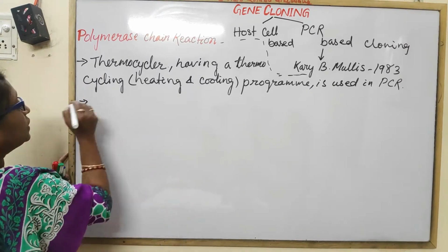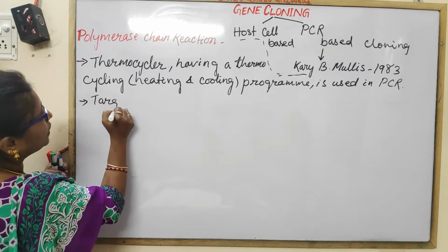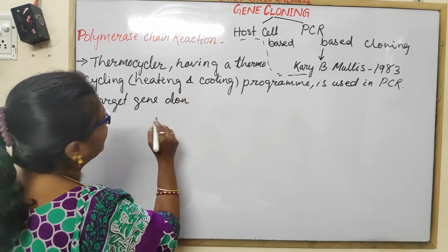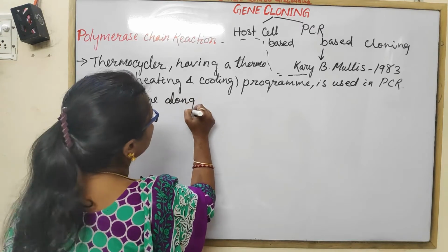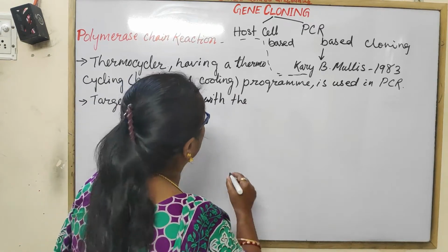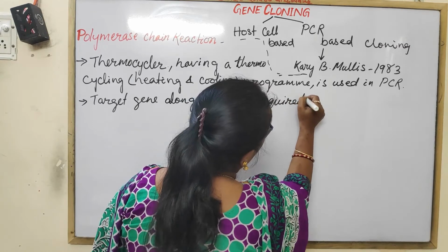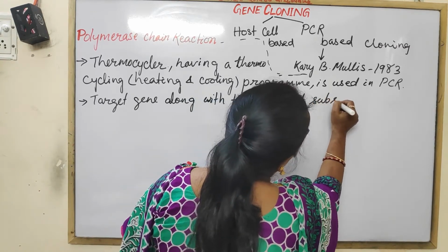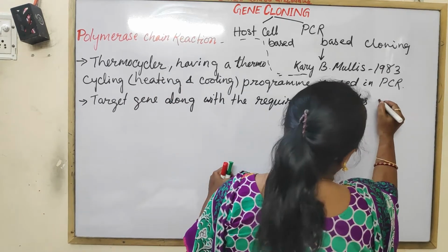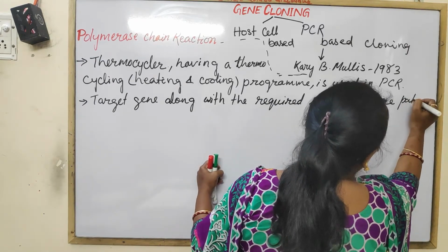Here the target gene is introduced along with the required substrates. What are the required substrates? Substrates are put into this thermocycler.